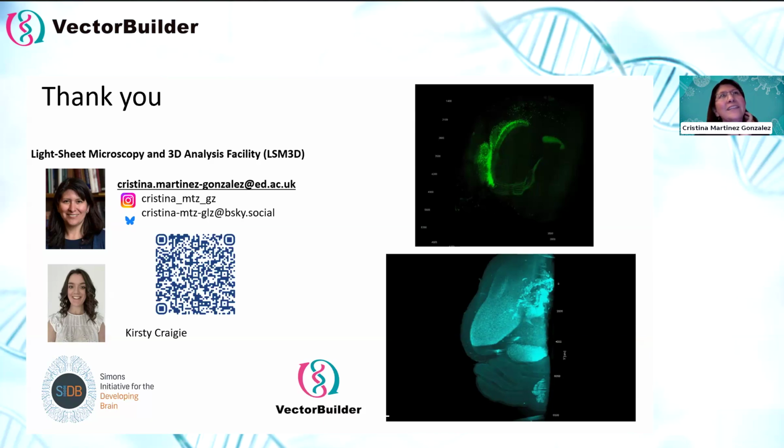The cross-linking. Yeah. One way we do, for example, not for DNA, but some antibodies don't like overfixation, especially CFOS. We published that in our paper. 3 hours post fixation, any longer, and the CFOS immunolabeling can be unreliable.